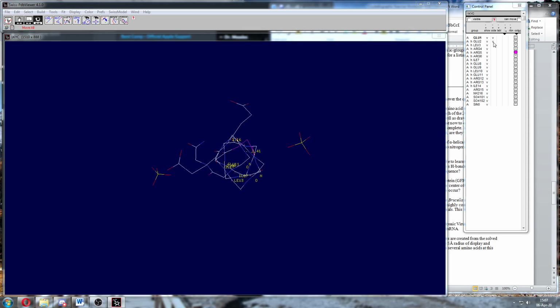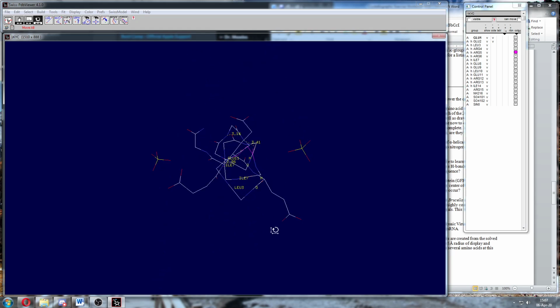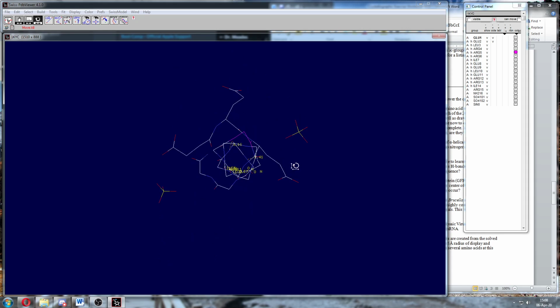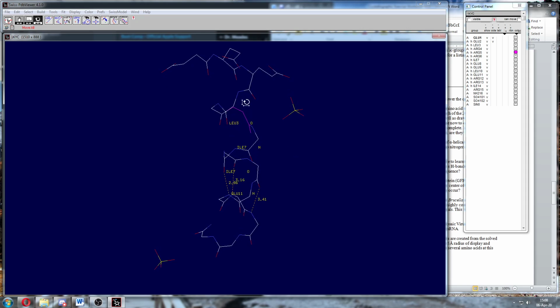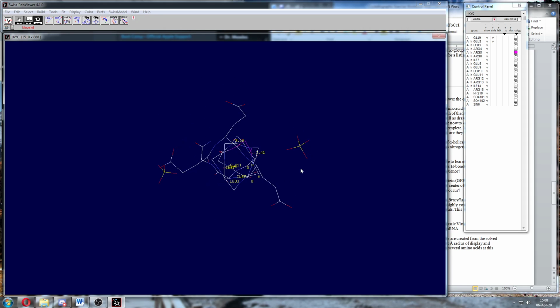And the next one, when I turn it on, you notice it's pointed this way. It's another glutamate, right? How far is the angle between this one and this one? Well, I don't know if you did this in lecture, we did it in the lab for sure. The angle between them is determined by how fast they rotate around this helix, right? So if it takes 3.6 amino acids to make one full rotation, how far is each one rotating? Well, it's 360 degrees in a full rotation, and it takes 3.6 amino acids to go all the way around. Each one's turning 100 degrees.